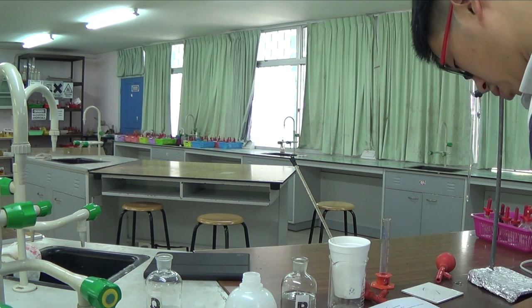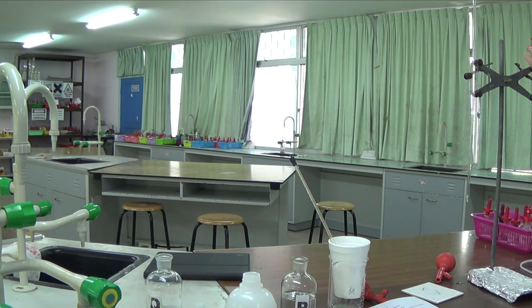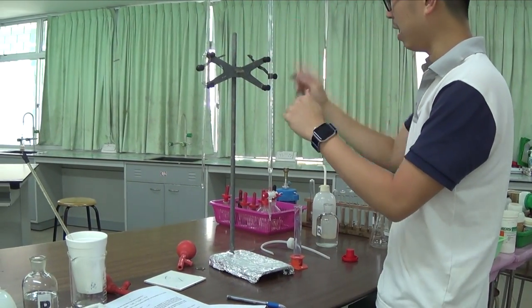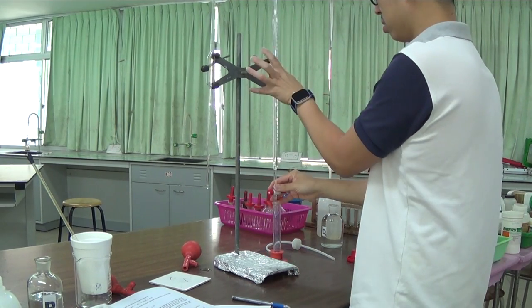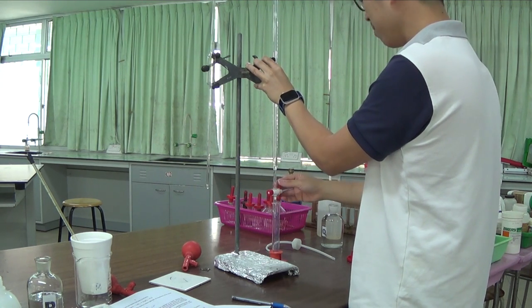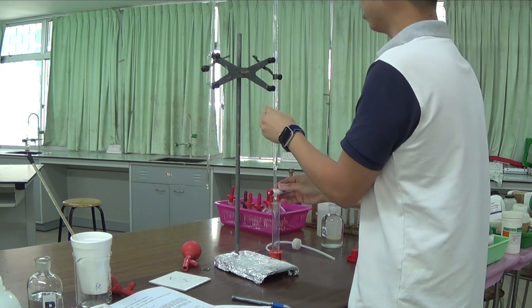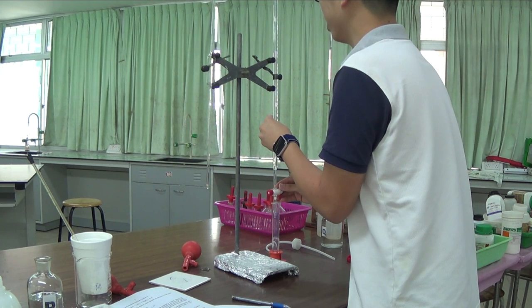So how much do I need? I need 18.0. So I start from 0.00. If I start from 0.00, I need 18.0 cm cubed of Q. So I will stop at 18.00. The thing with this is that you must make sure that your burette gets held very tightly. Otherwise, you risk breaking your burette.